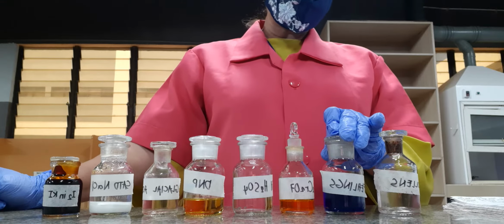of copper. But the precipitated product is cuprous oxide, which is a brick red precipitate, and the solution on top is still blue in color. Once again, cuprous oxide is a reduced product, and our oxidized product is also a salt of carboxylic acid.